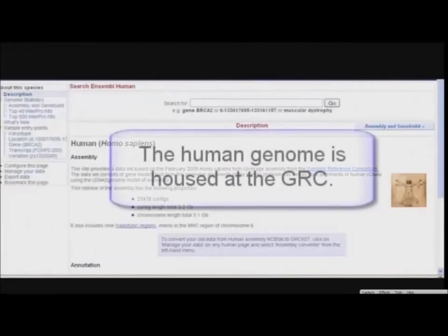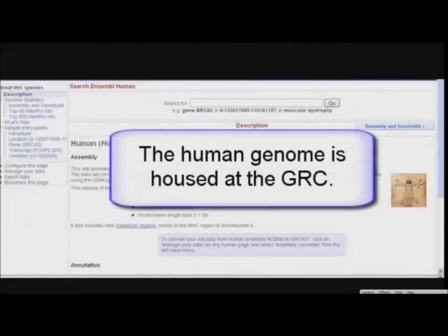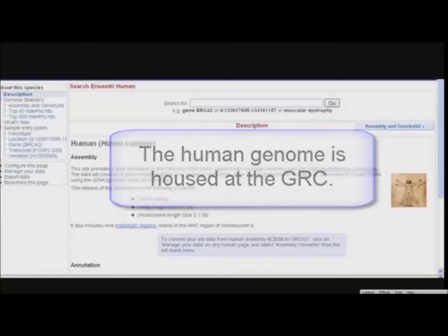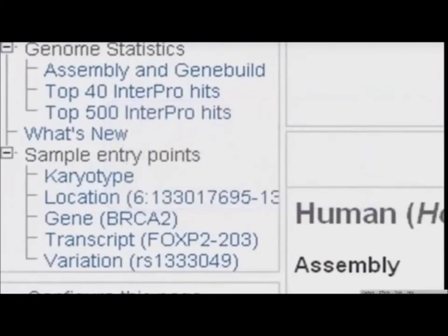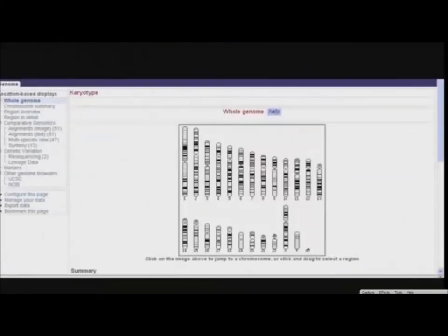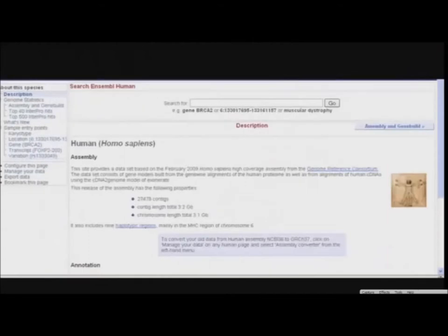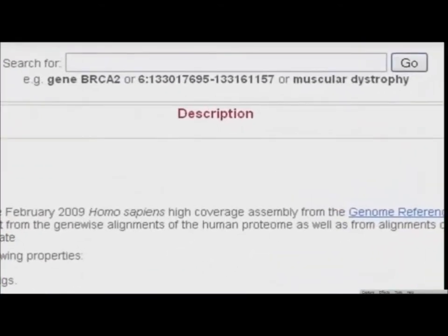Here we find information about the assembly used and any alternate sequences for haplotypic regions. For example, for human, nine alternate assemblies are included. Links on the left-hand side show statistics and dates for the gene build. We can also reach the karyotype. Now we will search for a gene by typing CDKN2B gene at the top of the page and clicking Go.